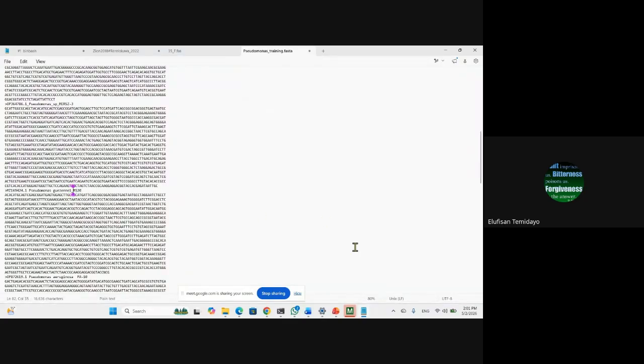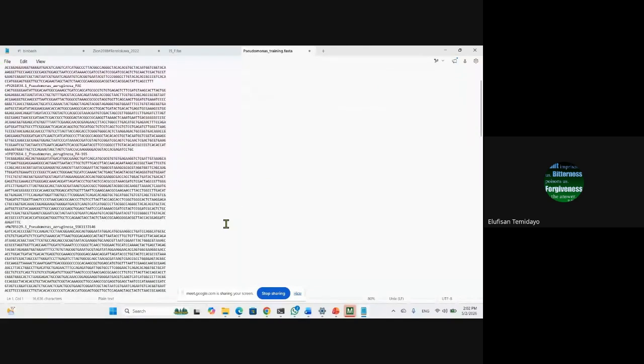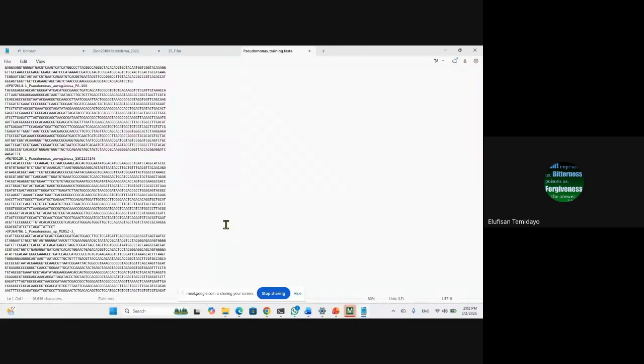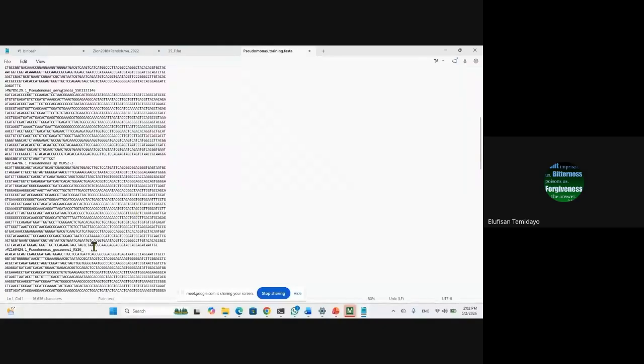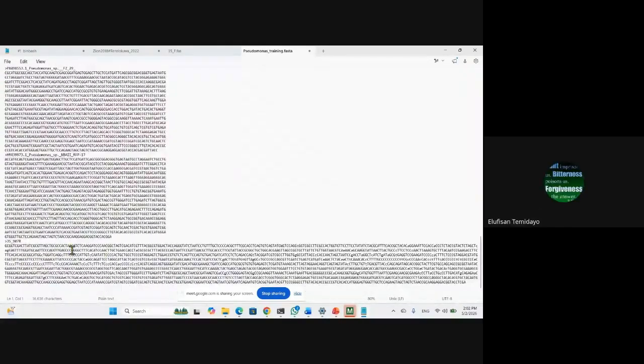Okay, let me try this again. Let me see. Okay, I think it worked. Thank you very much. Yeah, that worked. So we don't know this. We already know the name of this one. Okay, so let's say Control S.